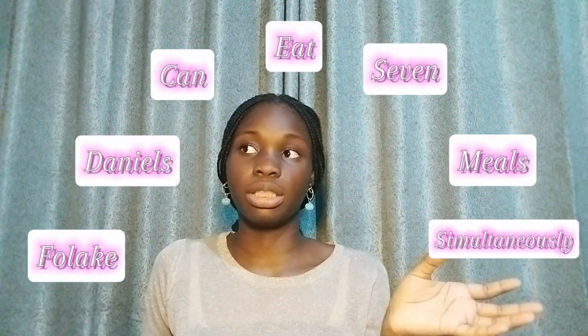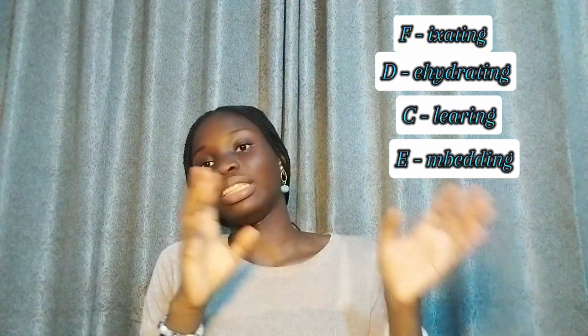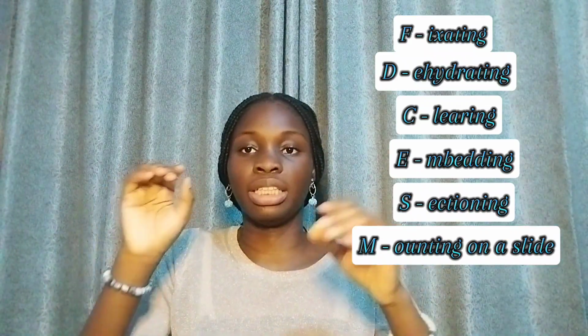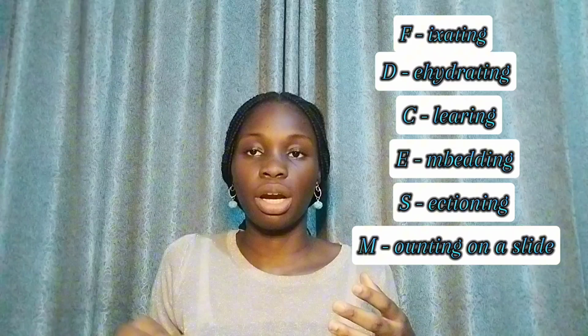Before a tissue can be fully or properly understood and studied under a microscope, it has to go through seven processes. And I summarize the processes into a mnemonic called Falake Daniels can eat 7 meals simultaneously. So the F stands for fixating, D stands for dehydrating, the C stands for clearing, the E embedding, the S for sectioning, M for mounting it on the slide, and then the last S for staining.